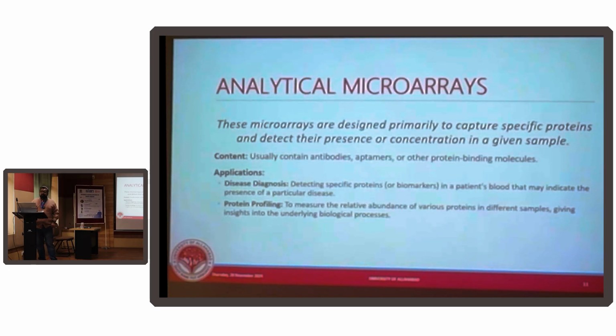One thing I think all of you must have understood by now, nowhere did I mention that you have to deplete your sample, right? You don't have to deplete your sample. The sample processing step in these microarrays is minimal. If you're working with blood, and we have worked for COVID, all we took was the serum, and we diluted it 100 times, 200 times.